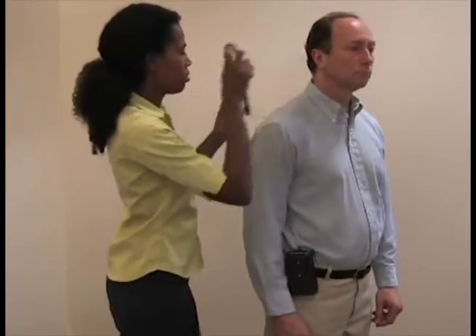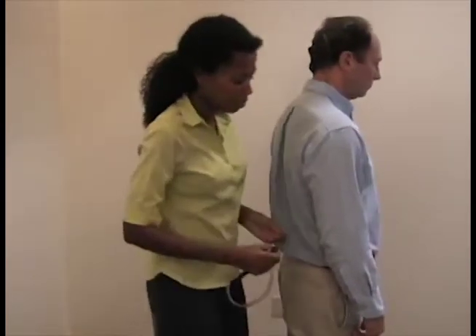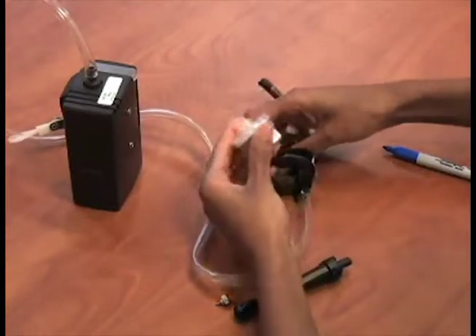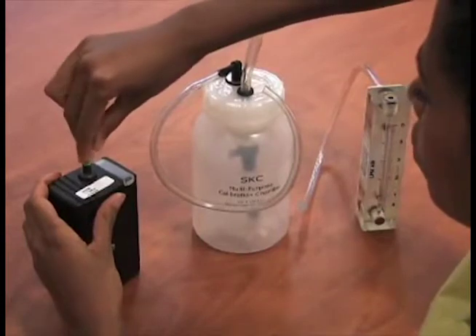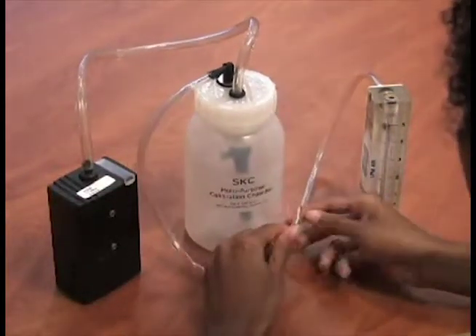After sampling is complete, turn off the pump, remove the equipment, and record the time off on the field data sheet. Remove the cassette from the cassette holder, reinstall the nibs, and label the cassette. Perform the post-calibration the same way you did the pre-calibration, using the marked calibration filter cassette assembly.